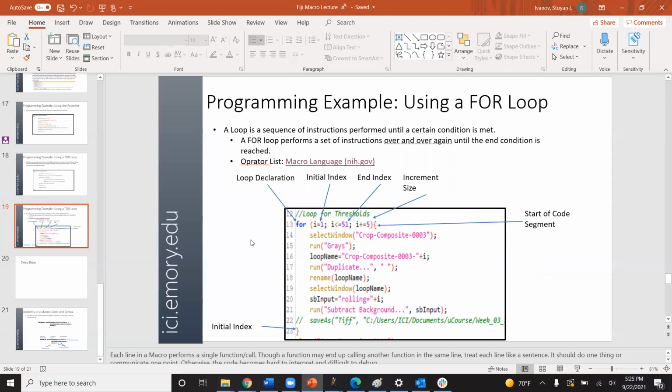That is an excellent question. Thank you for asking it. If you all look at line 16 and line 20, as Gaurav mentioned, what I'm doing there is something called concatenation. I have a name or a string that I want to use.